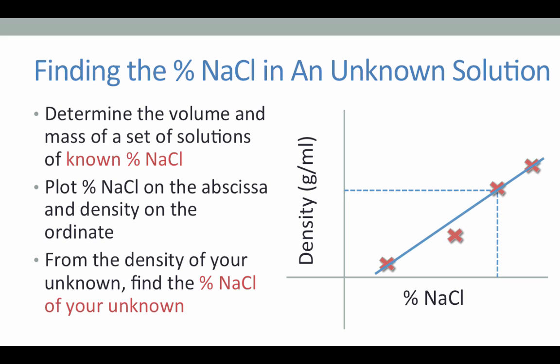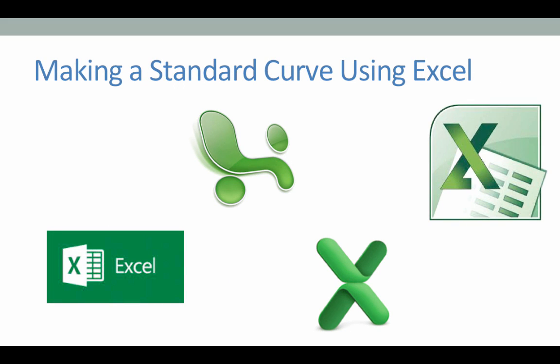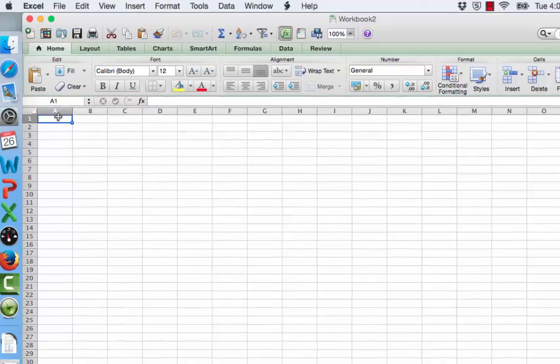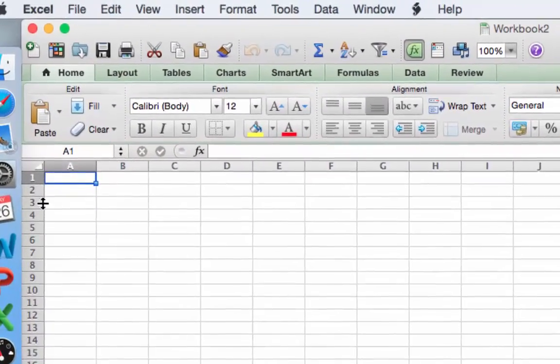To ensure that you're getting the best trend line that fits through your data points and to increase the opportunity for high accuracy in your calculations, it's best to use a spreadsheet program such as Microsoft Excel to prepare your standard curve. I will now go through how to prepare a standard curve using Microsoft Excel. I currently use the Macintosh version of this software. However, all versions of Excel are very similar and these instructions should guide you how to use Excel on any of its incarnations.